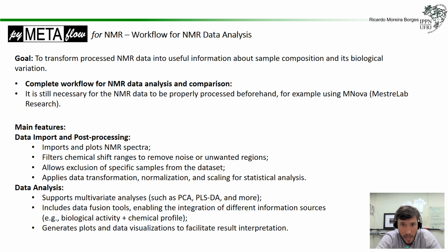For the data analysis, we support multivariate analysis such as PCA, PLS-DA, and some more, and we are always increasing the range for that. We include data fusion tools, enabling the integration with different information source like biological activity for natural products, or chemical profiles, for example, or HPLC traces, or even LCMS. And we generate plots and data visualization to facilitate the results interpretation. This is always nice, and everything gets documented.